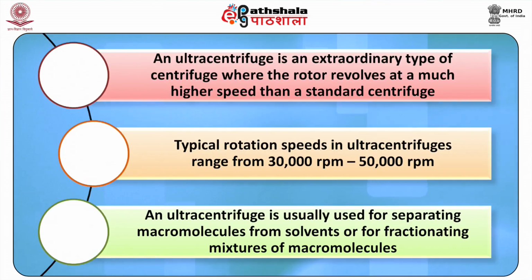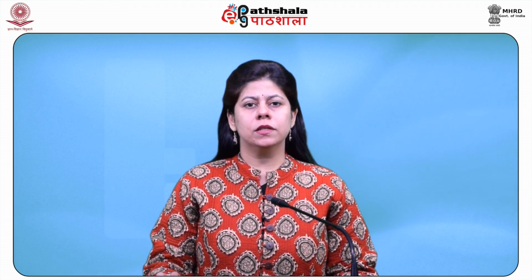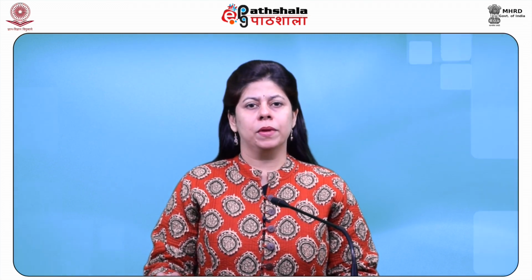Ultracentrifuge. An ultracentrifuge is an extraordinary type of centrifuge where the rotor revolves at a much higher speed than a standard centrifuge. Typically, the rotation speed in ultracentrifuge ranges from 30,000 rpm to 50,000 rpm. An ultracentrifuge is usually used for separating macromolecules from solvent or for fractionating mixtures of macromolecules. Ultracentrifuges are developed for analytical as well as for preparative applications.